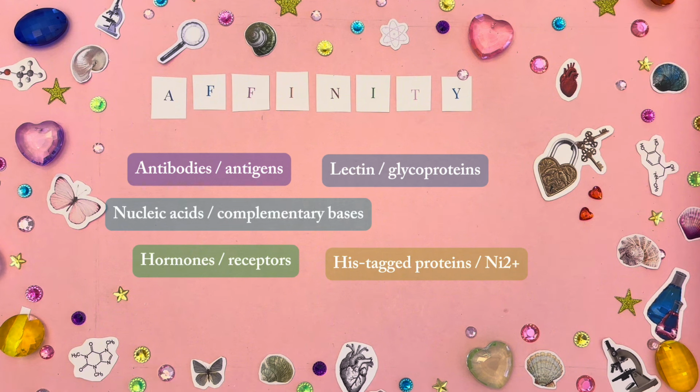What used to take multiple steps, such as precipitation, ion exchange, then ultracentrifugation, can be done with one affinity capture step. Some caveats, though, are that it is usually more costly, often requires development of the ligand, and some elution conditions might stress the molecule.